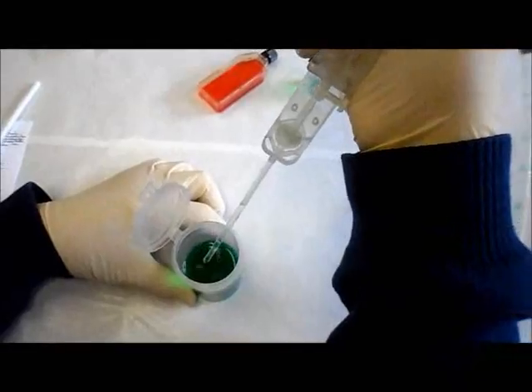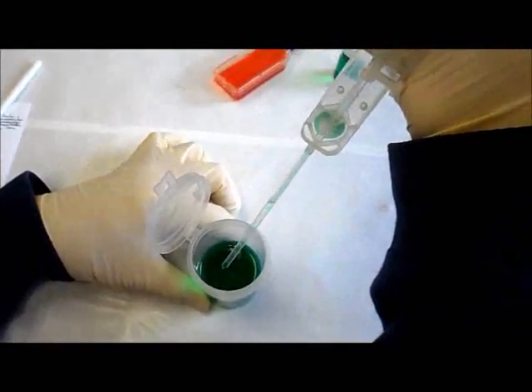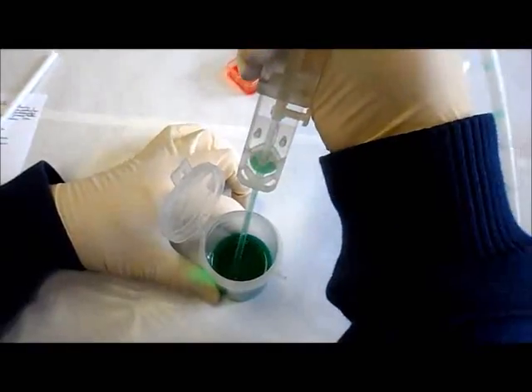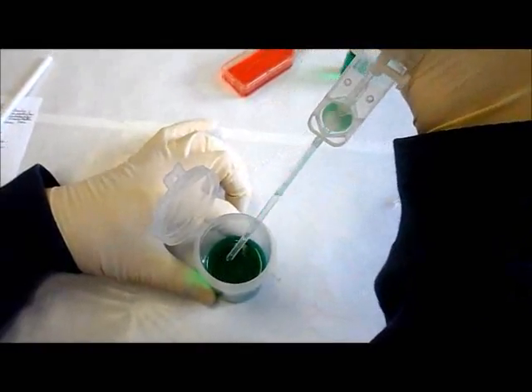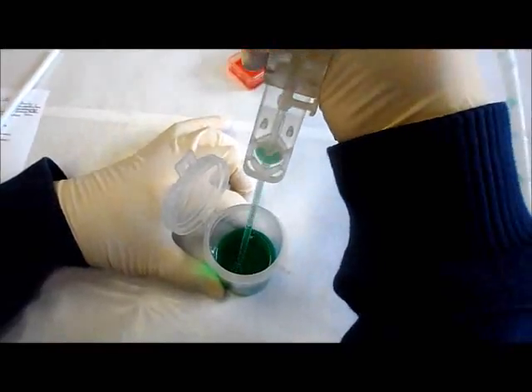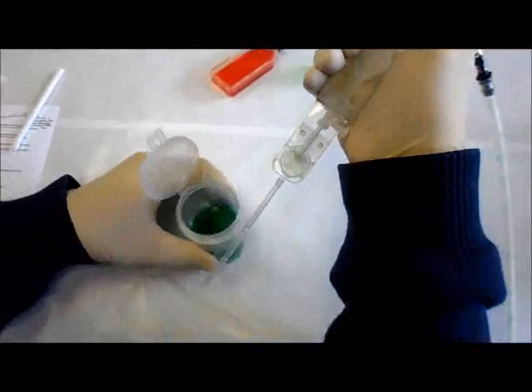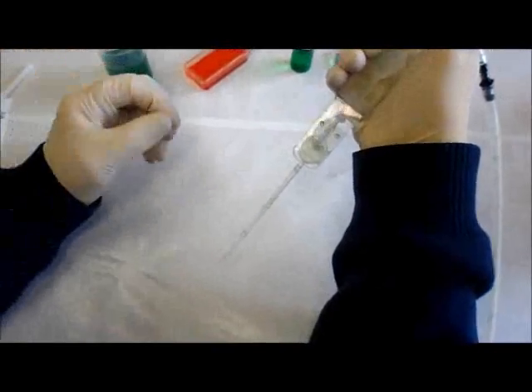I've intentionally drawn the filter out of the fluid and I'm not going to put it back in to show you that I can reestablish flow and I can do this at will. I have no problem going back and forth from air to the liquid. You cannot do that with a conventional syringe filter, which I will show you in a moment.